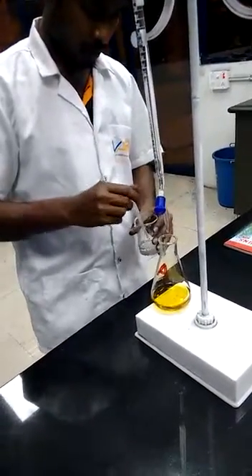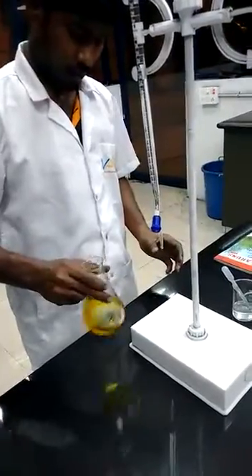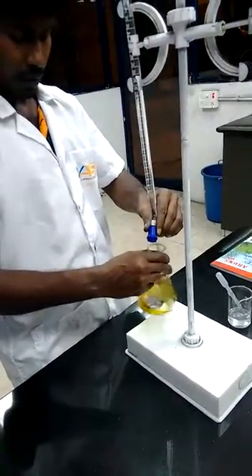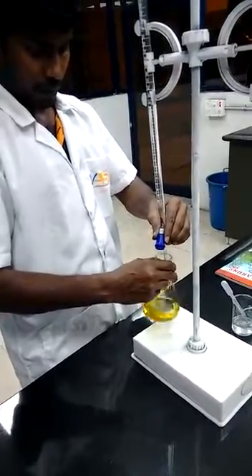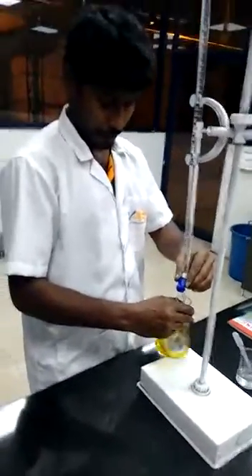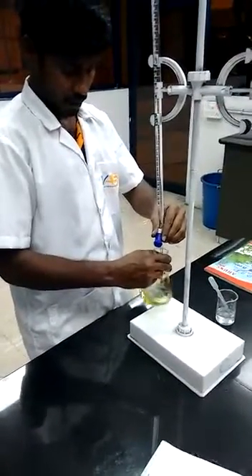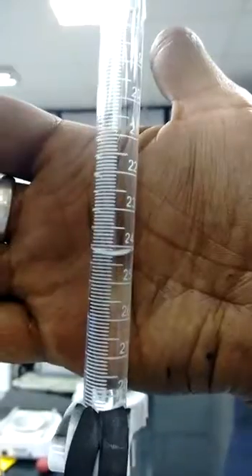Add the solution into the conical flask, then do the titration until the solution changes color to clear. After the solution changes to pure white — that is, without any color — take the burette reading. The burette reading has come to 24.3.